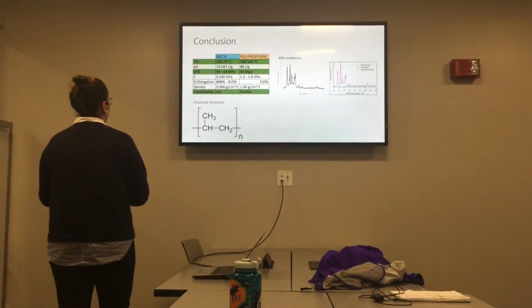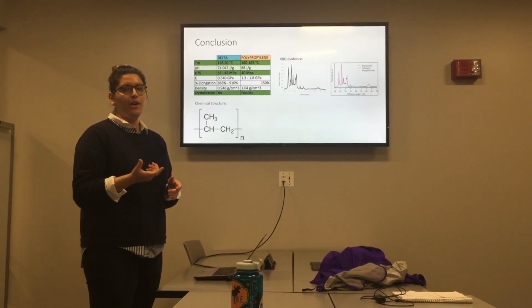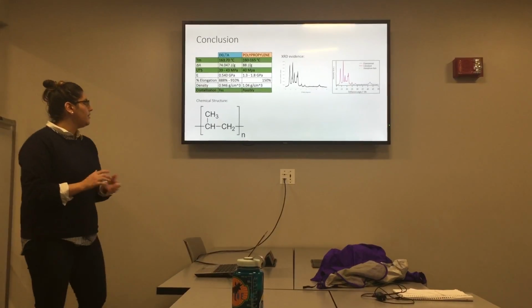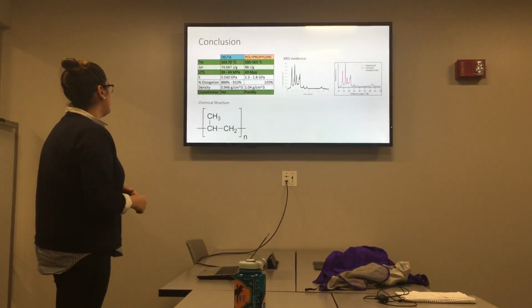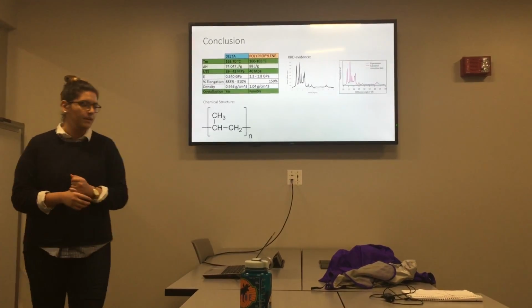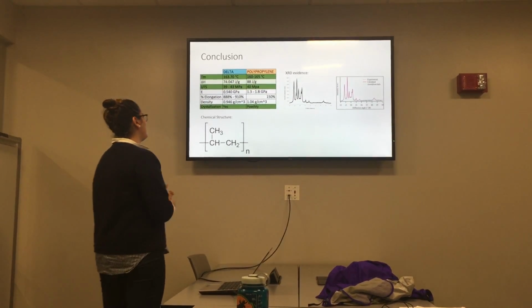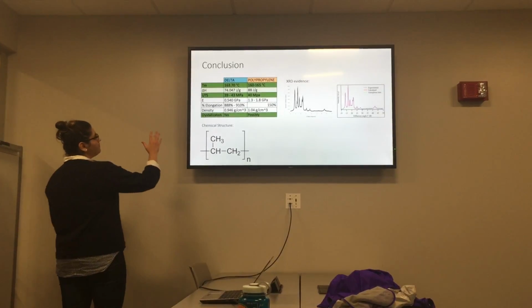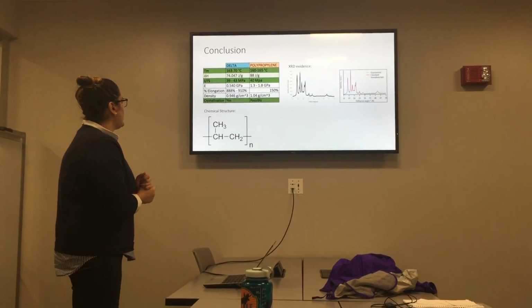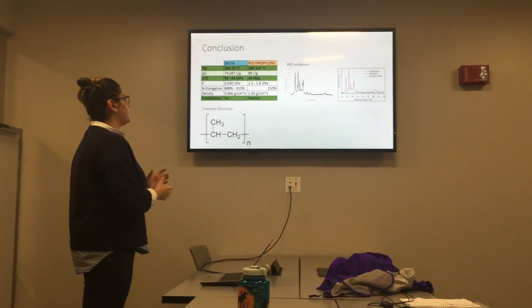We found values to be 39 to 43 MPa, and the window is coming from the two stress strain curves that we generated. The literature value we found was 40 MPa, which is right in the middle. Again, very happy about that. As Maggie talked about, we looked at an optical micrograph and found good evidence of crystallinity, and polypropylene is very able to be crystallized. I don't think crystallizable is a word, but yeah, we're pretty happy about that. The delta H is actually pretty close. We know that it's not as spot on as the other ones, but it's definitely in an acceptable window.